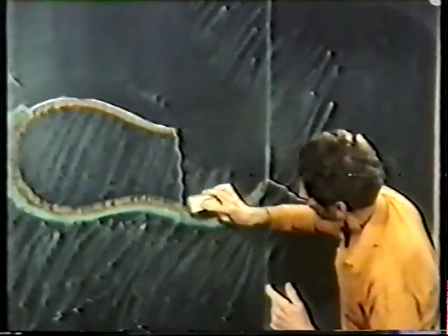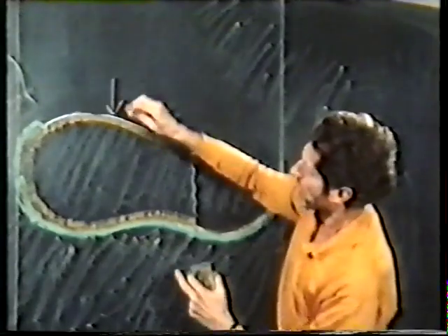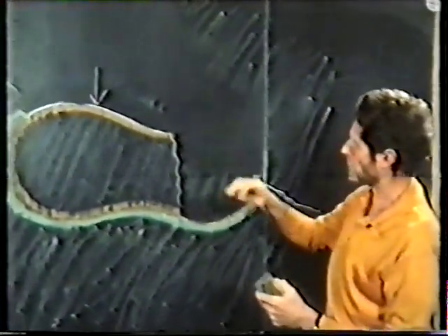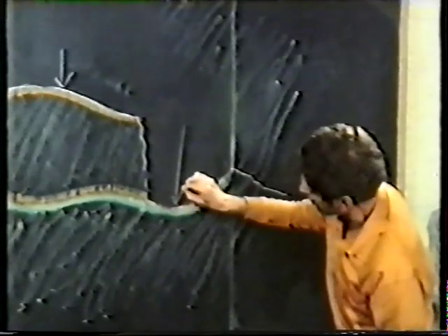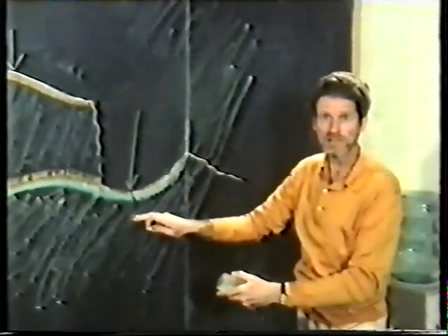And what we're left with over here is the half of the membrane closest to the protoplasm. The half membrane closest to the extracellular space has been fractured away. Whereas here, we fracture through the cell itself, scoop it away, and what we're looking at is the half of the membrane closest to the extracellular space.